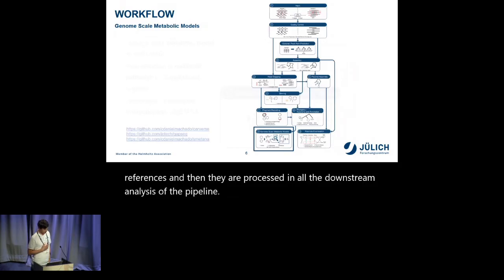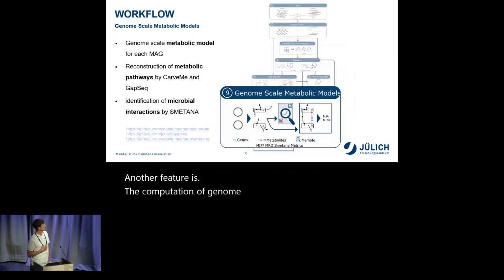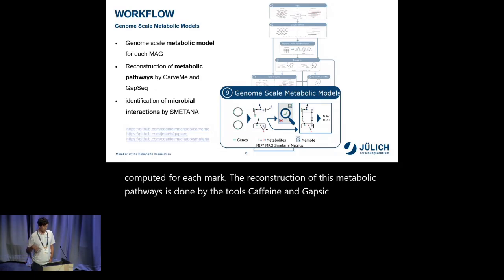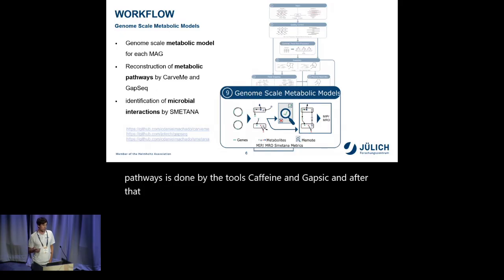Another feature is the computation of genome scale metabolic models. They are computed for each MAG. The reconstruction of these metabolic pathways is done by the tools CarveMe and gapseq, and after that, you can identify microbial interactions by using SMETANA in the toolkit.